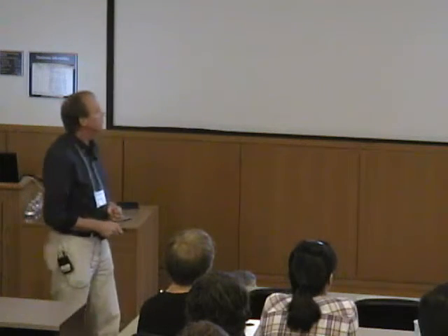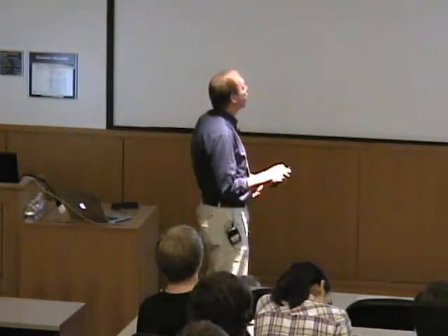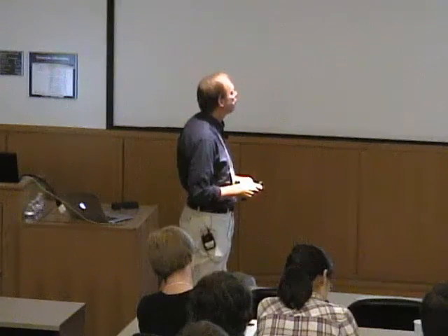All right, so there are some general trends that you should be aware of if you're looking at EPR spectra. For radicals with light elements, the spin-orbit coupling depends on the mass of the elements involved and increases as the mass goes up. So if I have a radical with very light atoms like carbon, hydrogen, and nitrogen, the g values are very close to the free electron value. So we get very small perturbation away from the g value, and the g anisotropy is also typically very small.